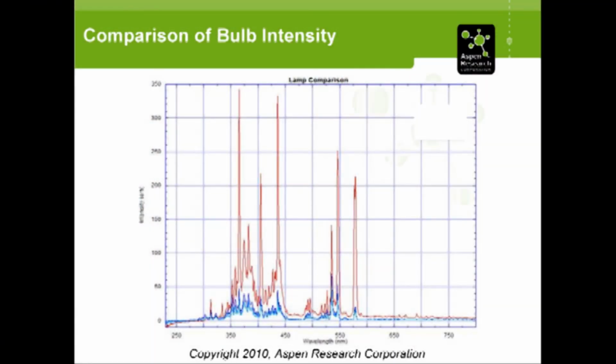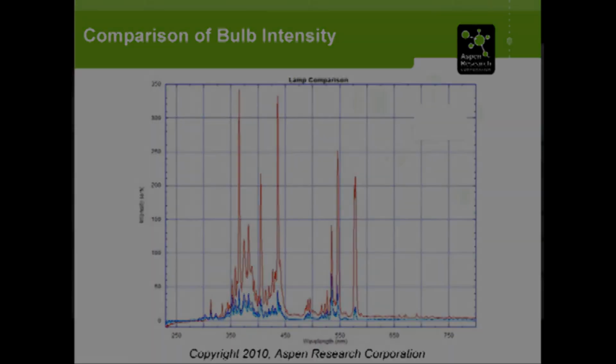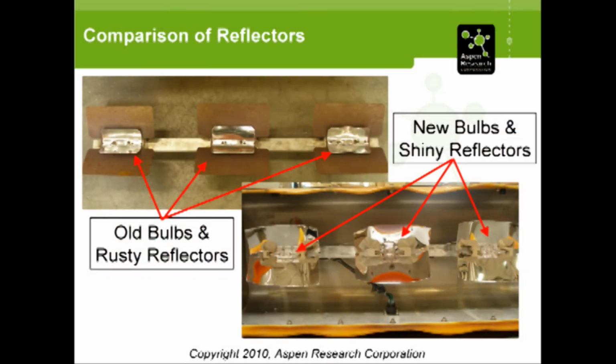So we got new bulbs, put those in, and ran the intensity spectra of the two. In the areas of interest in UV, below about 400 or so, you can see that the new bulbs, with the red line here, were about 3 times brighter than the old bulbs. And we saw a similar situation when we looked at the reflectors that were available. The upper picture here shows what the reflectors were like. There was some shiny metal here, but it was surrounded by tremendous areas of rusty panels that were doing absolutely no good at all in terms of reflecting the light.